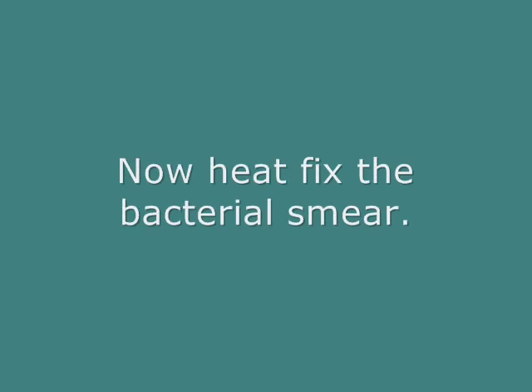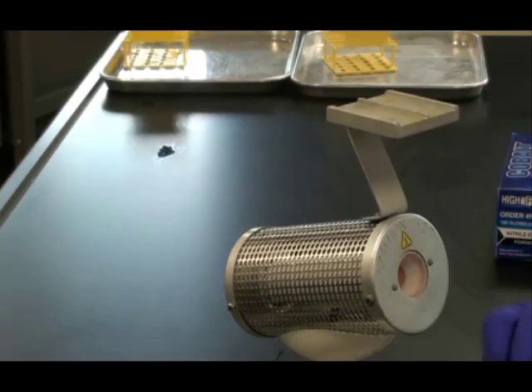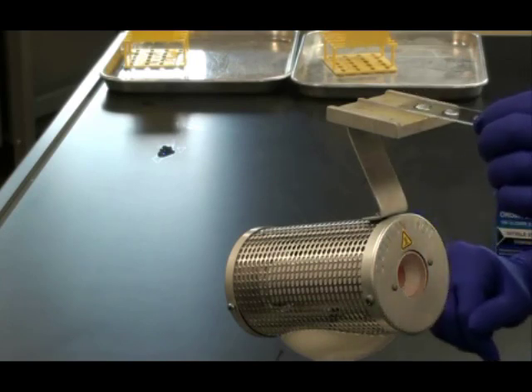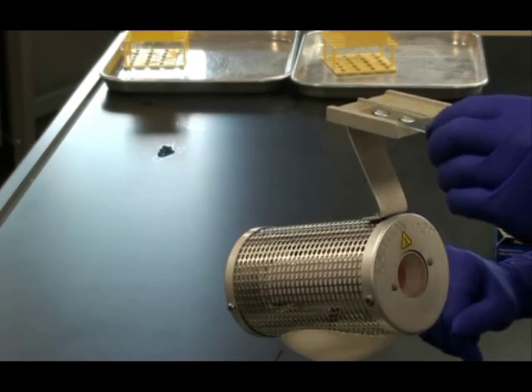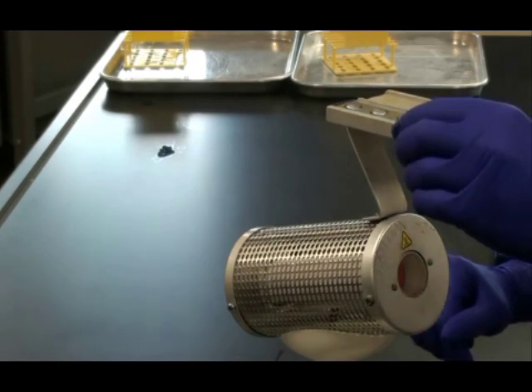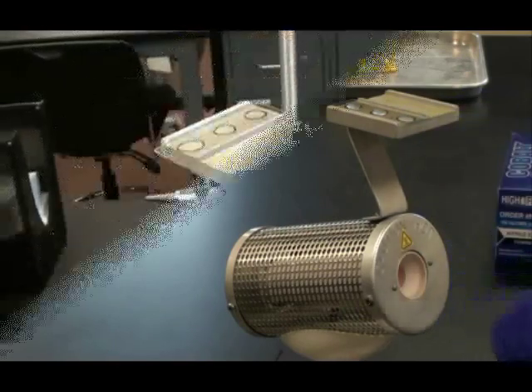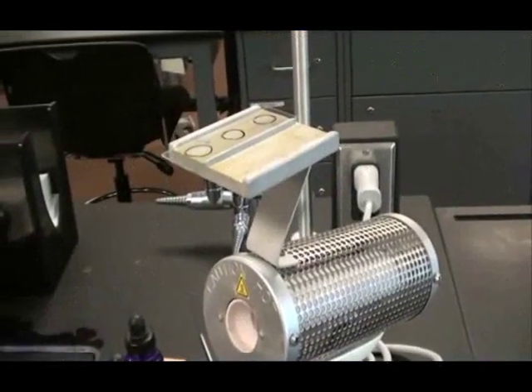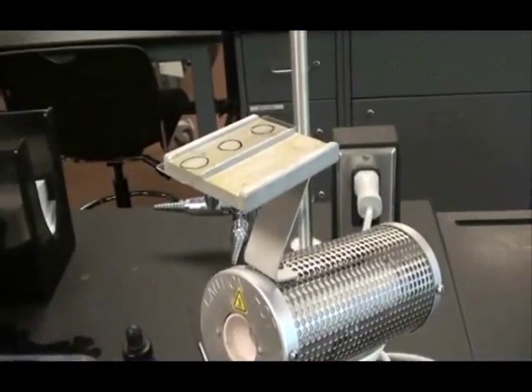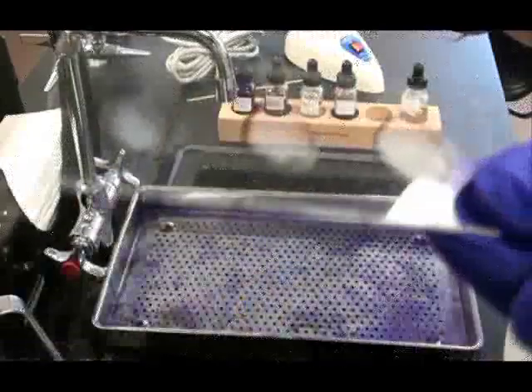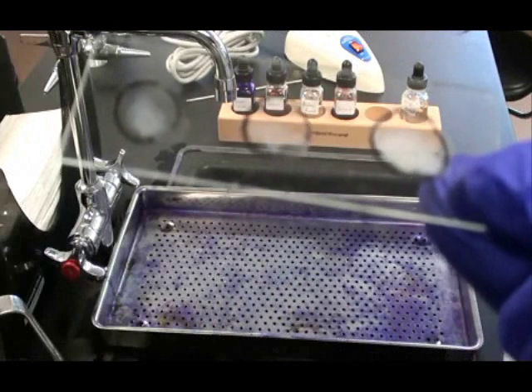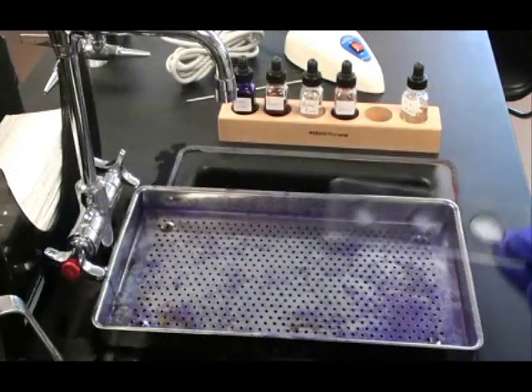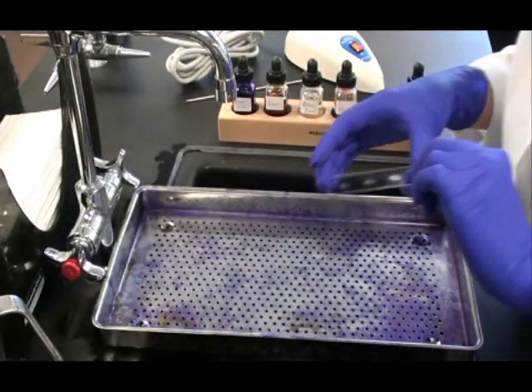Now I'm going to heat fix my bacterial smear. I very carefully move that slide to place it in the slide tray on top of the microincinerator. You need to be careful so the droplets of water don't run together. I have to wait about five or ten minutes until the bacterial smears are dried. Heat fixing kills the bacteria and sticks it to the slide so that I can now perform my Gram stain.